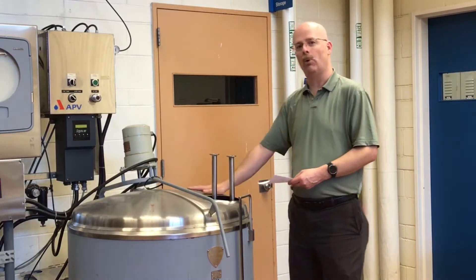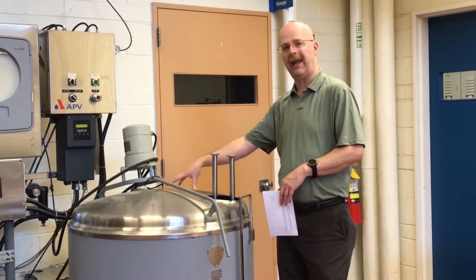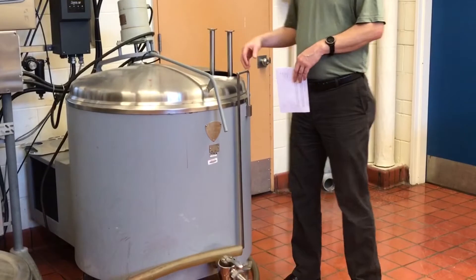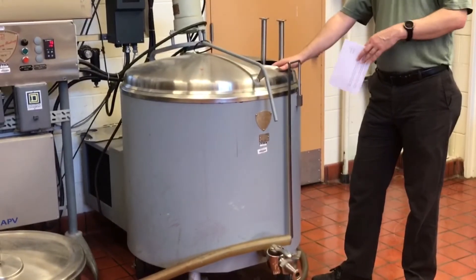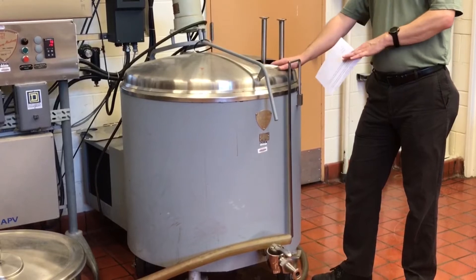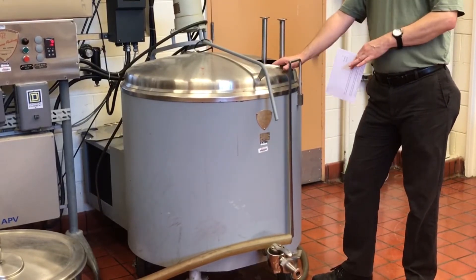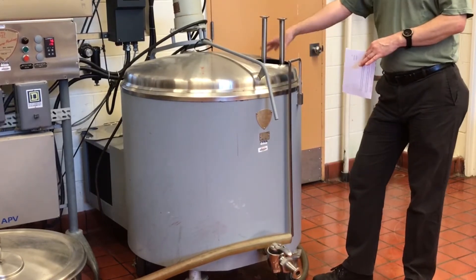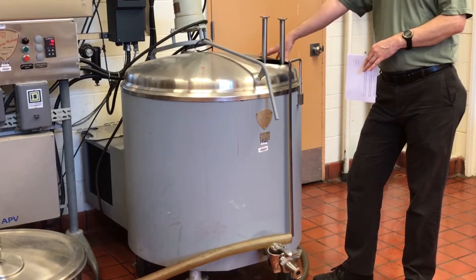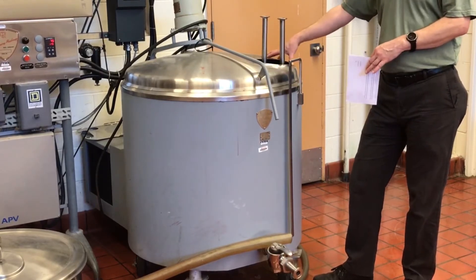The first component in the system is our refrigerated holding tank. This is a double-walled insulated tank that's designed to hold the raw milk at low 40 degrees Fahrenheit. In the industry you'll be working with really large silos, but here we have a small-sized system, so this is our refrigerated holding tank to keep our temperatures below 4 degrees Celsius of the raw milk.